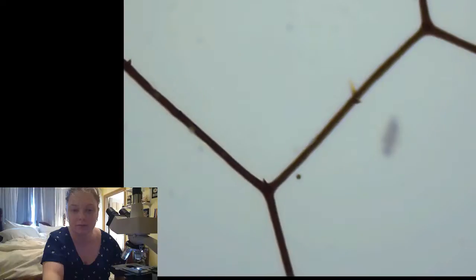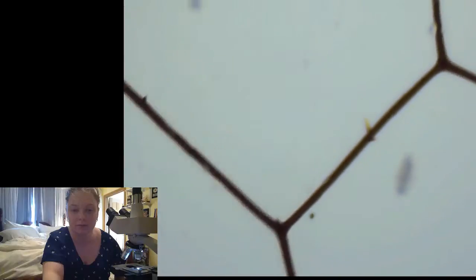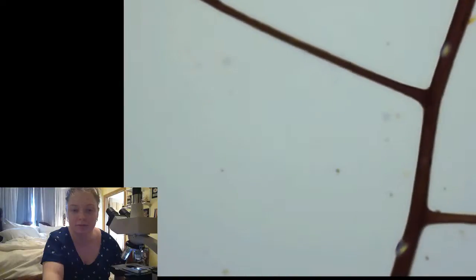So this is our dragonfly wing. You can see these little cells, basically shapes. It's kind of neat. It's not a very regular shape. Oh, it went a long way. Oh, it's because I left the wing by accident. There it is.